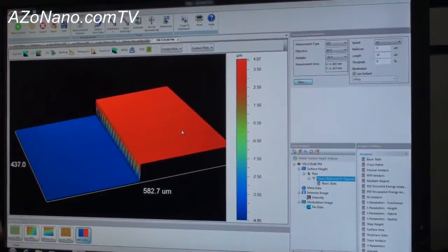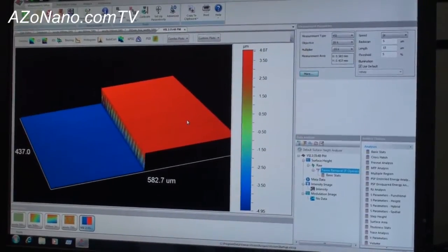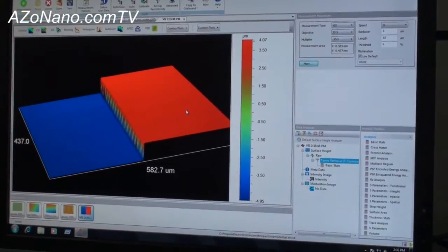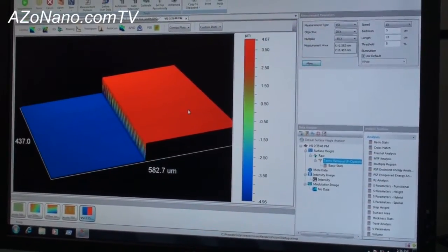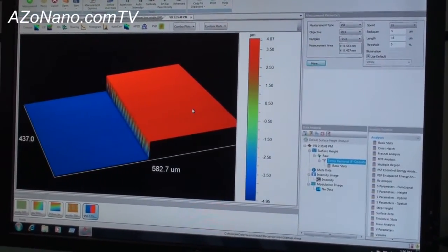So we talked about vertical scanning interferometry. We also do phase shifting interferometry and also the acuity XR which gives us better lateral resolution.